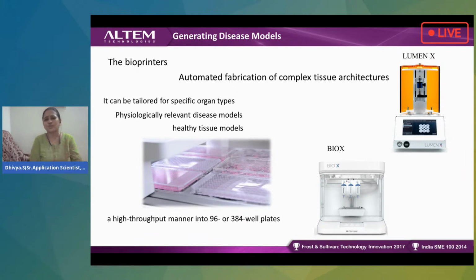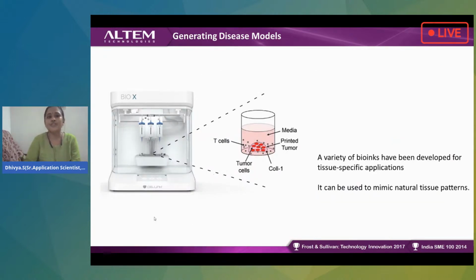What disease model you want to generate will keep cracking your mind. Any kind of disease model that we want to explore and study in detail can be done by using 3D printing with bioprinting technology. So this is an example that I'm trying to show to you.